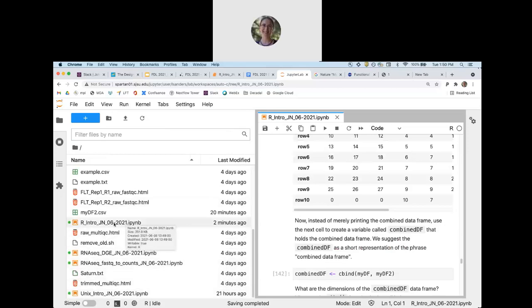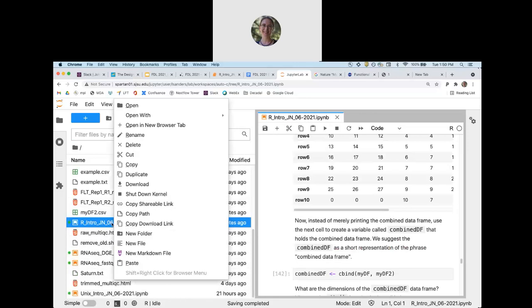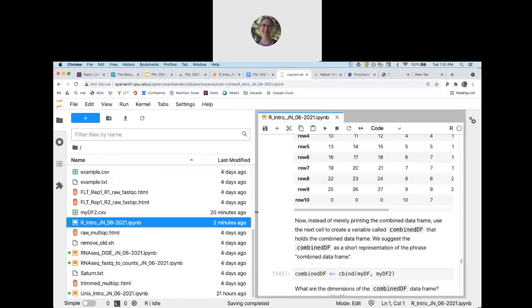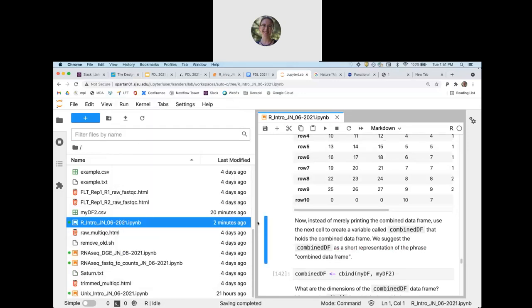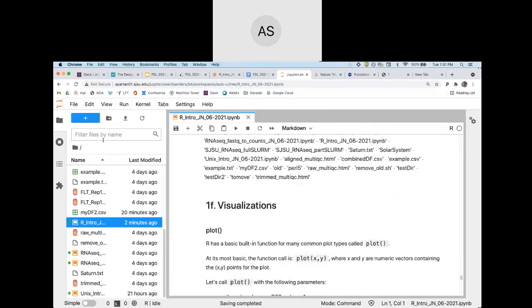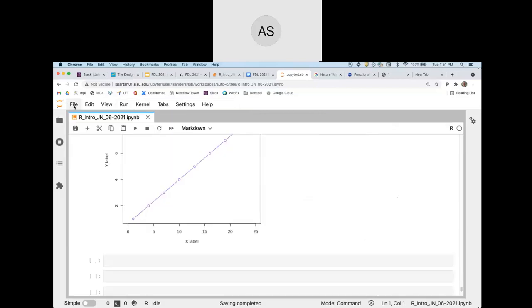Yes. So if you just, oh, you mean as an HTML, not as a PDF. Yeah. So how Jupyter notebook can be saved to their local machine. Right. Okay. I was thinking, how do they save the notebook file itself? But no, I see what you mean.